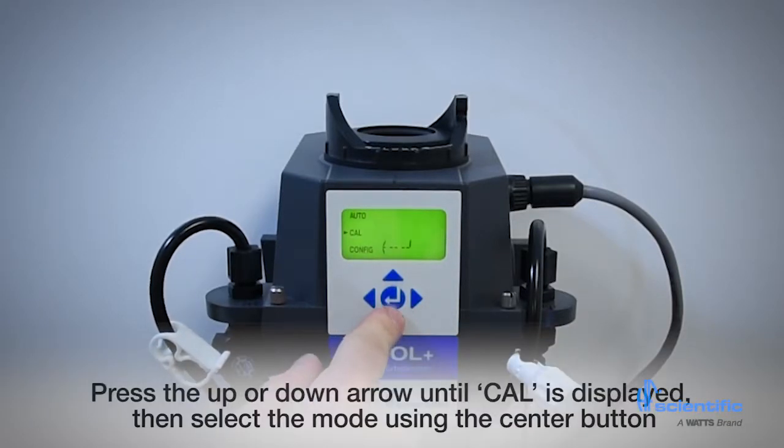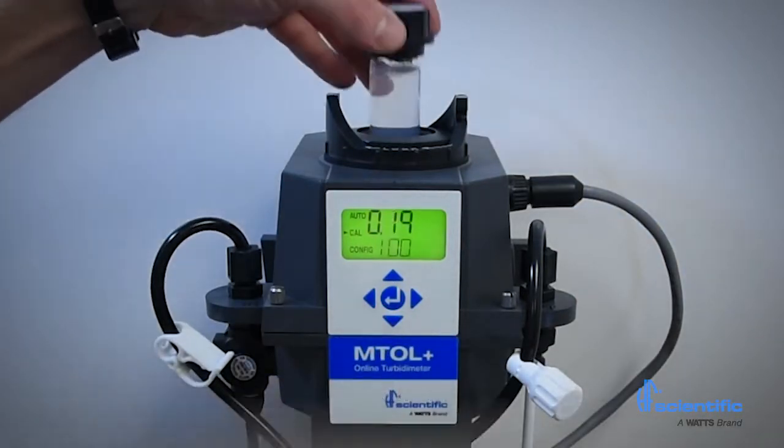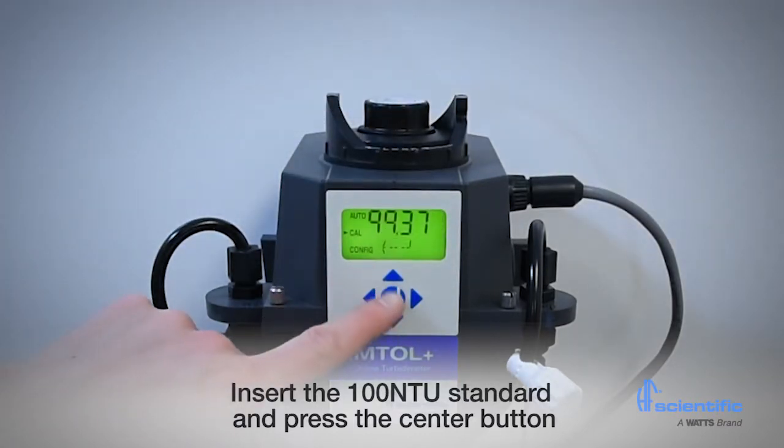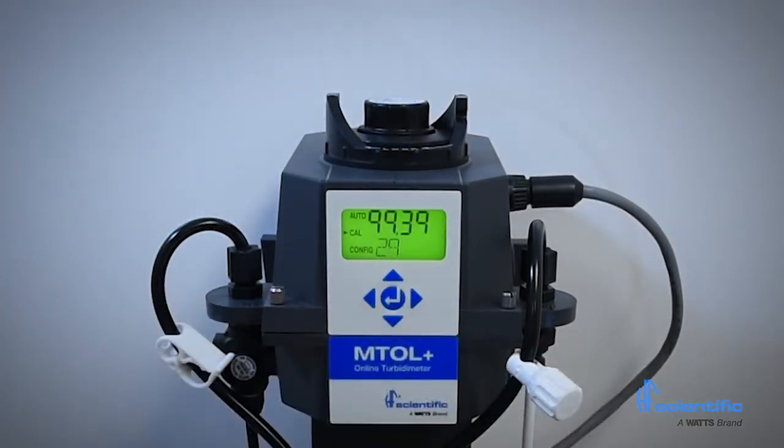To start, press the up arrow until CAL is displayed. Then select mode using the center button. The instrument will display 100. Insert the 100 NTU standard and press the center button. The instrument will count down 30 seconds and then display 10.